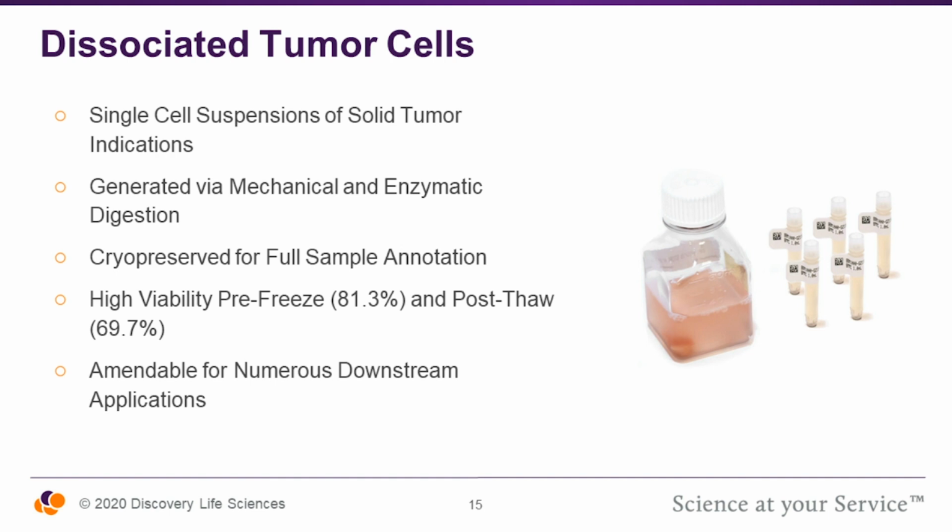So we let these cells cryopreserve. The cryopreservation is very good in terms of maintaining viability. After the thaw, it's still 70% or greater. And then that allows for the best annotation and selection of samples for downstream platforms.